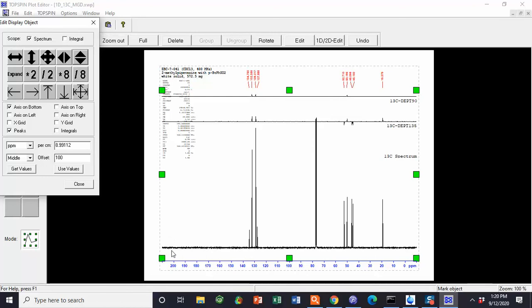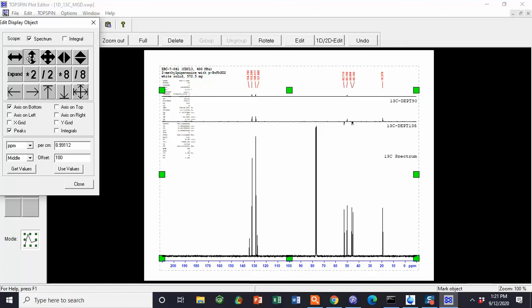You will also notice that there's a lot of space between this blue scale and the actual baseline. So you use this double-headed arrow that has the bar connecting the 2 heads to pull it downwards. You still want to be able to see that bit of static at the bottom of the baseline. You'll then hit close.